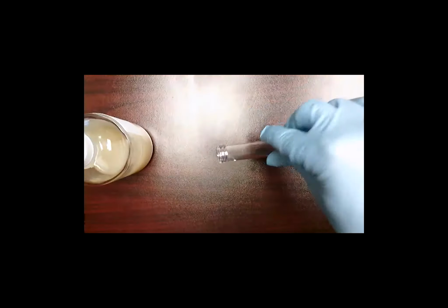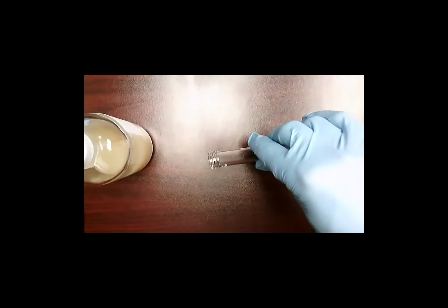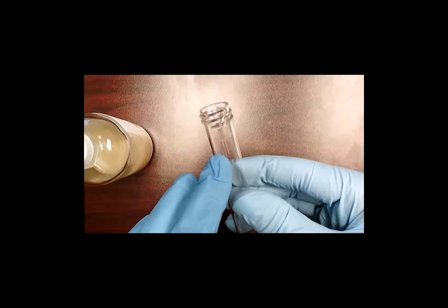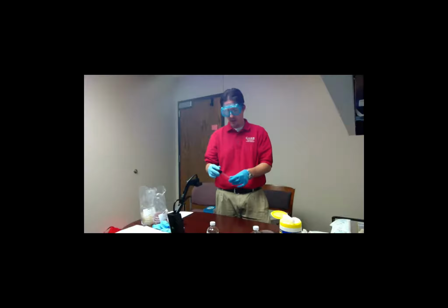So all you're going to do to collect water is when you're at your water source, you're going to open the lid, you're going to put it down, try not to touch rocks or mud or anything like that. You're going to put it down in the water. It works real easy, especially if it's a stream that has a little current to it, and fill it up. There is a line at the very top that you can fill it to. It's about where my finger is. Just fill it up and then immediately close the lid and screw it on. Now, it is suggested that the only time you have the black lid sealed tightly is during transportation, so when you're in the car or walking with the sample.